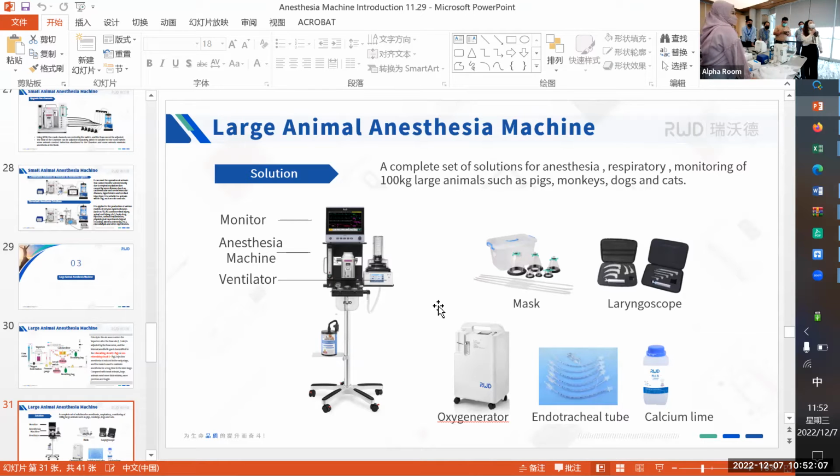Any questions? Yes, just one more. For example, if we want to infect the animal with a virus, or for smoke research, can we use the air pump to do that? Say we want to do a treatment or vaccine for influenza or SARS-CoV-2. Can we connect the virus into this and deliver it inside the chamber to infect the animal?